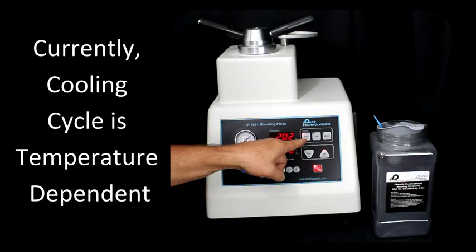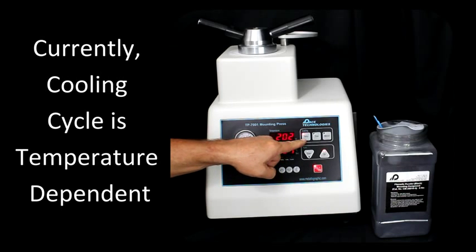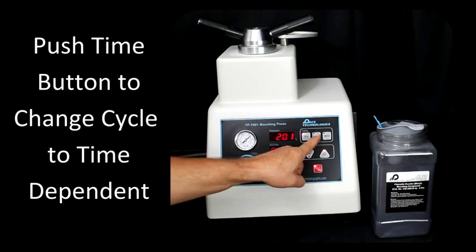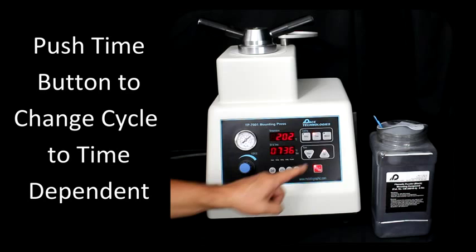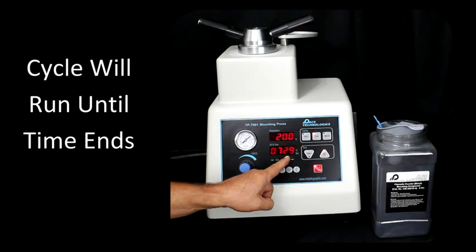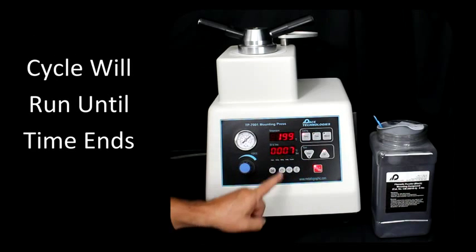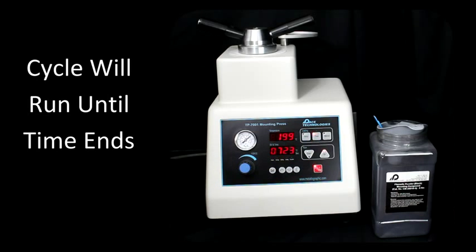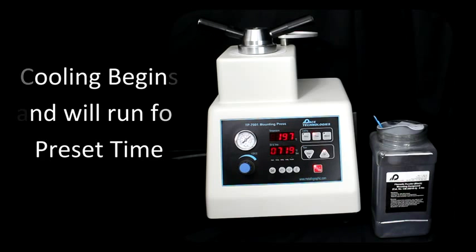Presently, we have the cooling cycle set to cool to a specific temperature. Before this counts down to zero, if we change this to time, now it will show how much time we have total before the cycle will end. So we've got eight more seconds here. Now we'll cool until this reaches zero.